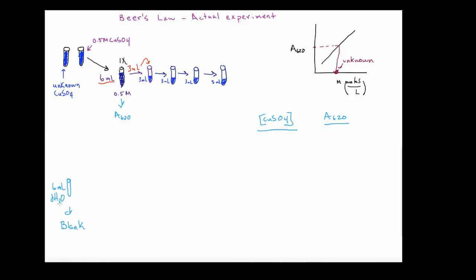If you're in a biochemistry lab, your 6 mL of DH₂O blank may be a buffer with other additives, so pay attention to what your system is. In general, you're going to blank the instrument. Then I transfer the 0.5 molar solution and get my A620. For my 0.5 molar concentration, my absorbance — and I did this for real — is 0.930.